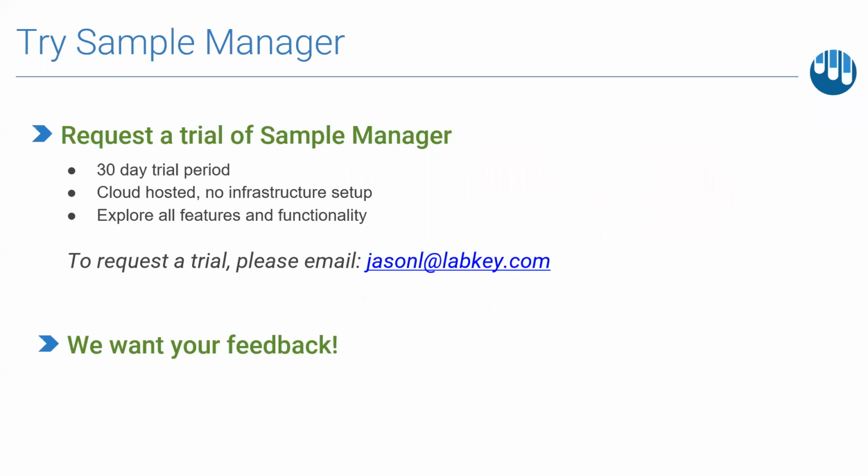So from here, what next? Well, we would like to invite you to register for a free cloud-hosted trial of LabKey Sample Manager. This will allow you to navigate the UI on your own terms, to get familiar with the structure and the navigation of it, and to upload your own data to give it context, and really to see for yourself just how easy and intuitive the product is. But more importantly, I think, to witness firsthand the efficiencies it could potentially bring to your working environment.